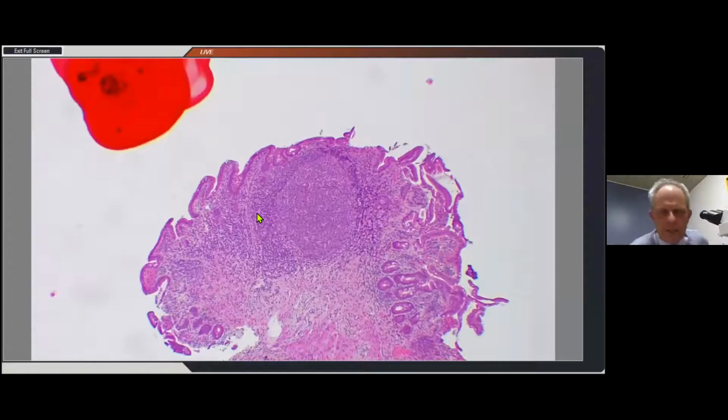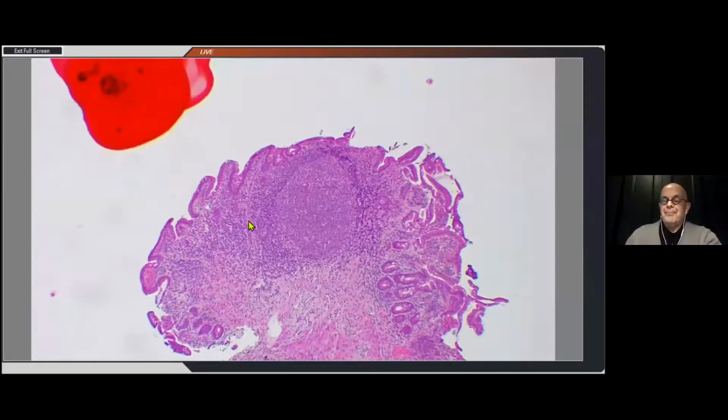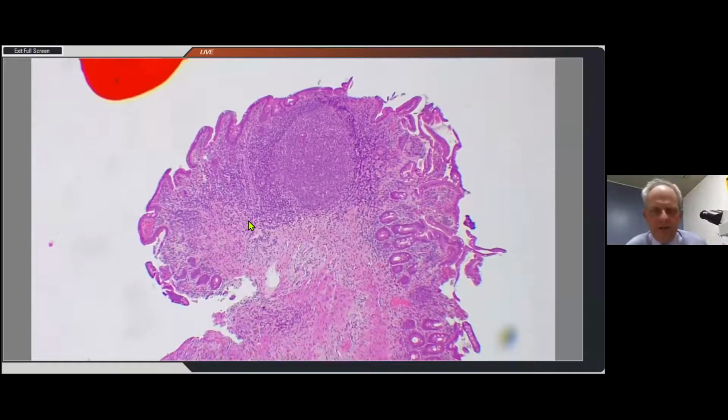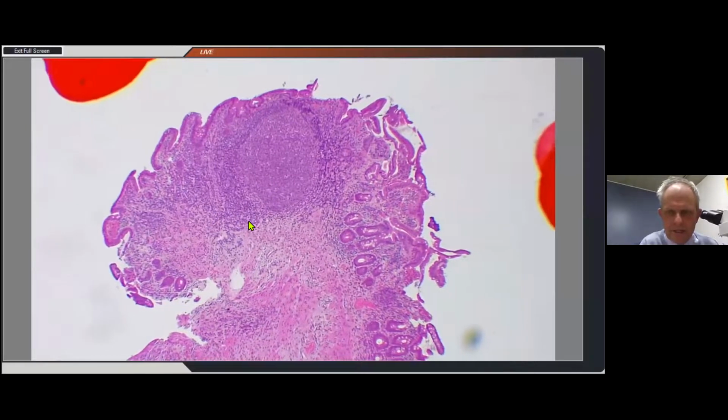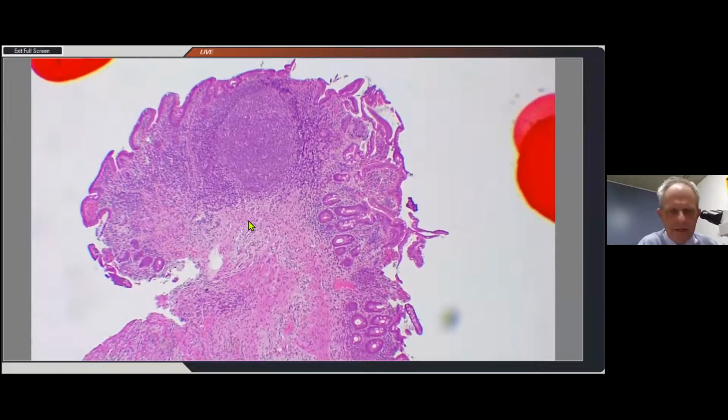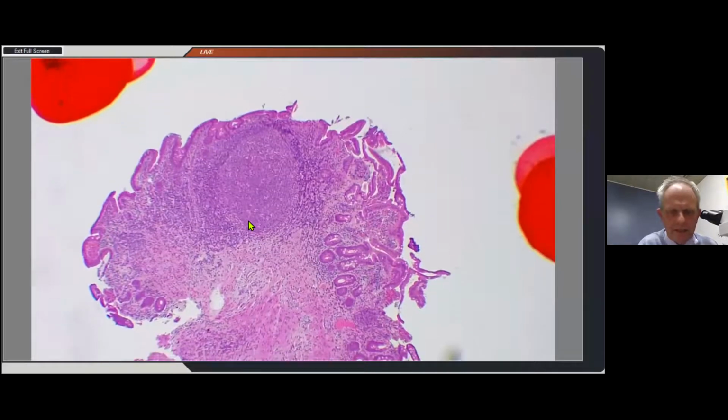Right, thanks, Barbara. So let's show you this. You should be able to see a histology there. Great. All right, so this is the duodenal biopsy. Once again, you've taken a photograph of what the normal duodenum looks like in your occipital cortex. By just comparing those two images, the one you've taken a short while ago and this one, you can see that there's a considerable difference.